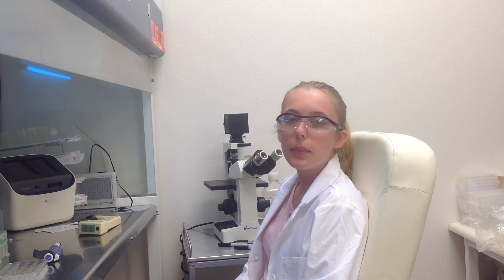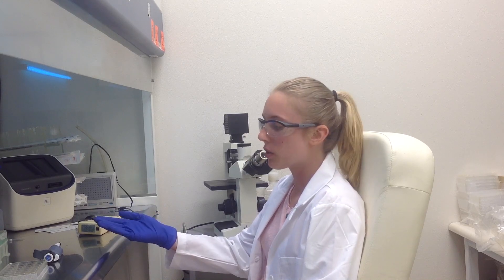Today we will be transfecting PANC1 cells obtained from ATCC. We will be using a transfection kit manufactured by Altogen Bio Systems.